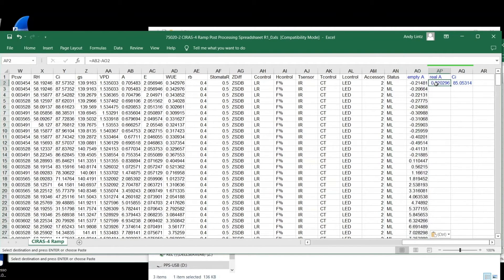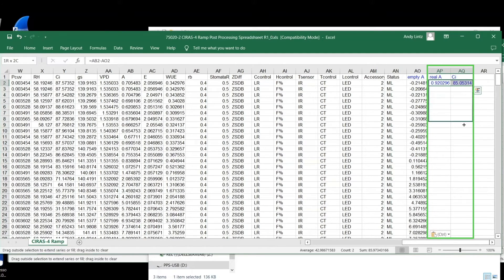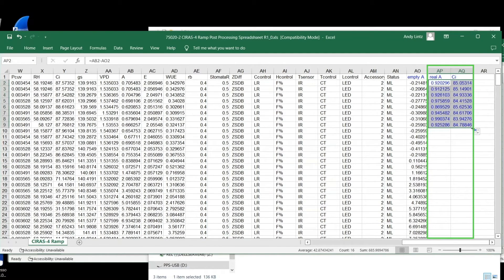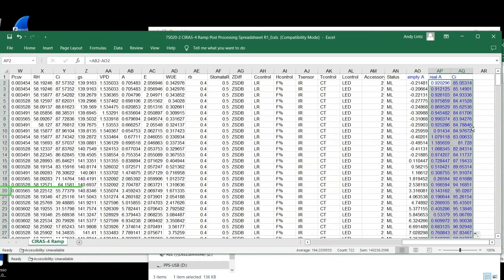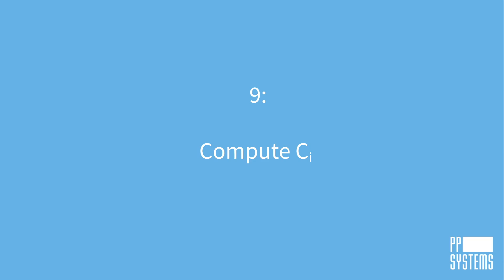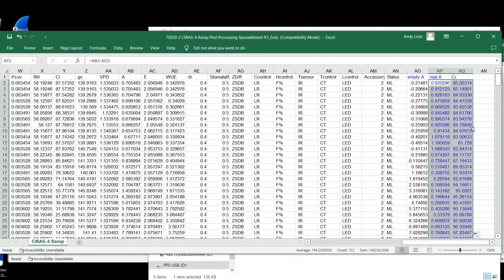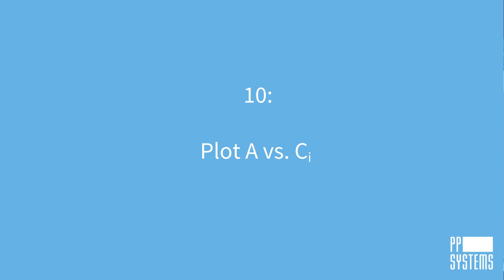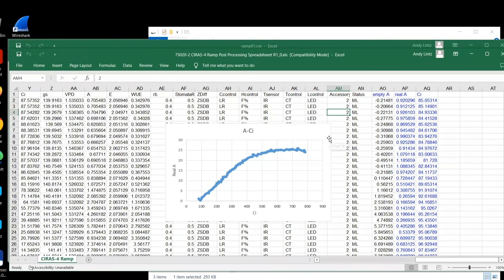Copy the formulas in columns AP and AQ down all rows. The actual assimilation rate is computed in column AP after a brief lag period, typically at about line 20. The substomatal CO2 concentration, Ci, is now recomputed in column AQ using the new actual assimilation and the other values that have not changed. Next, plot A versus Ci starting at about line 20 after the linear ramp stabilizes.